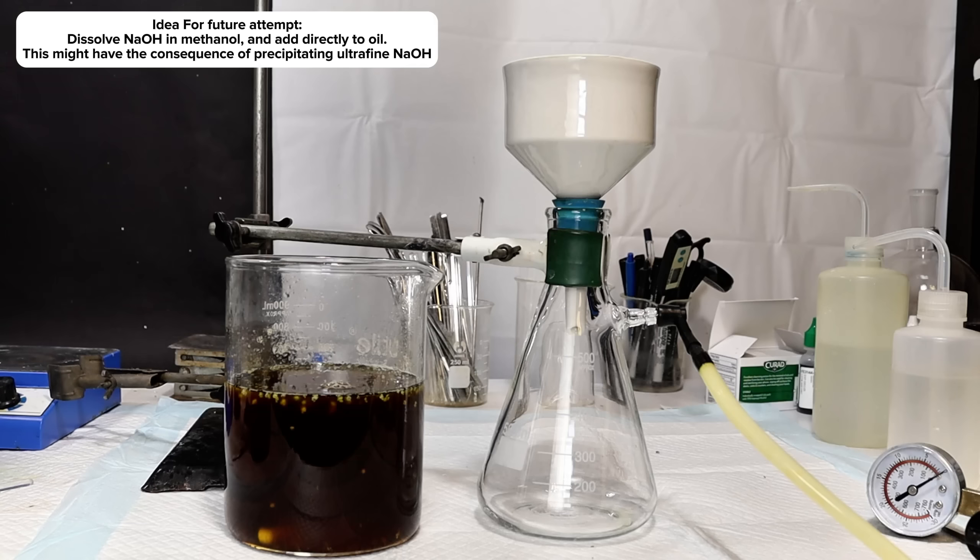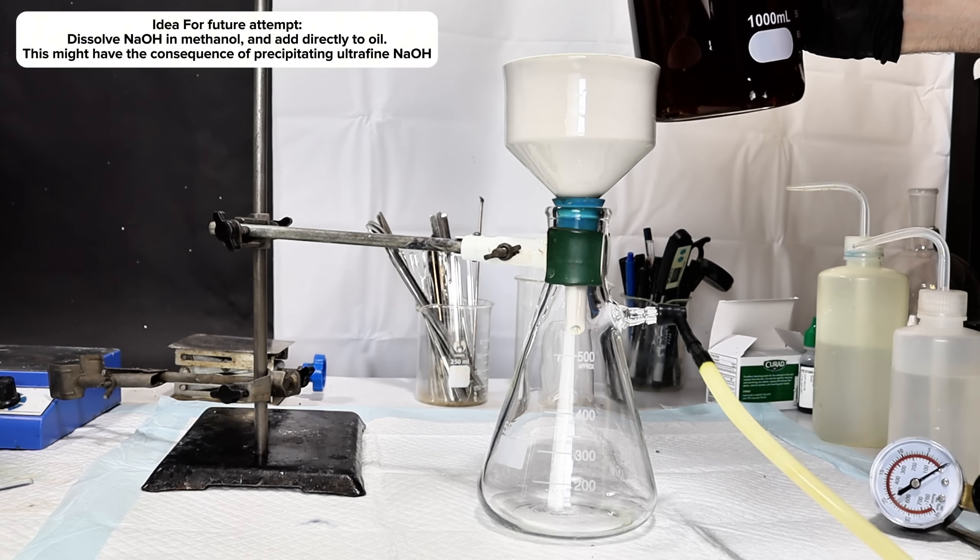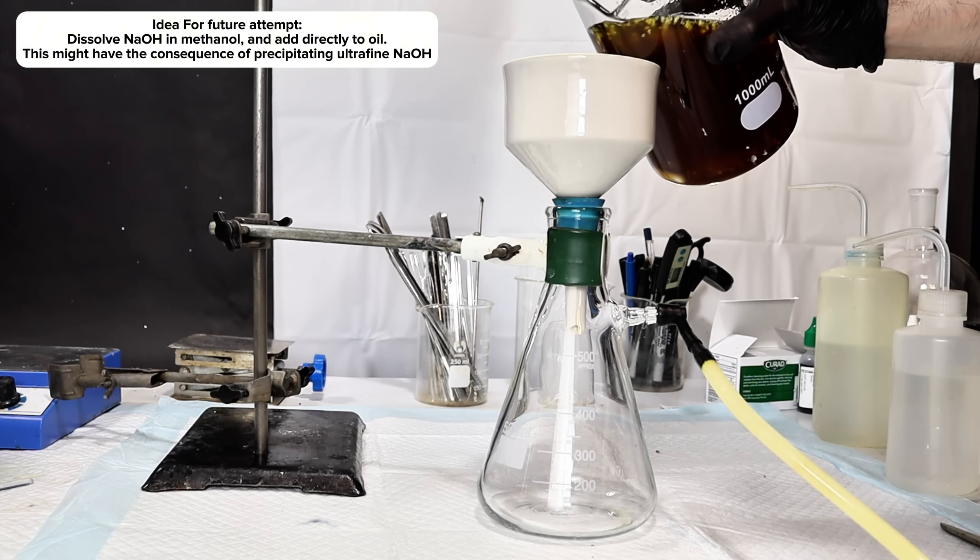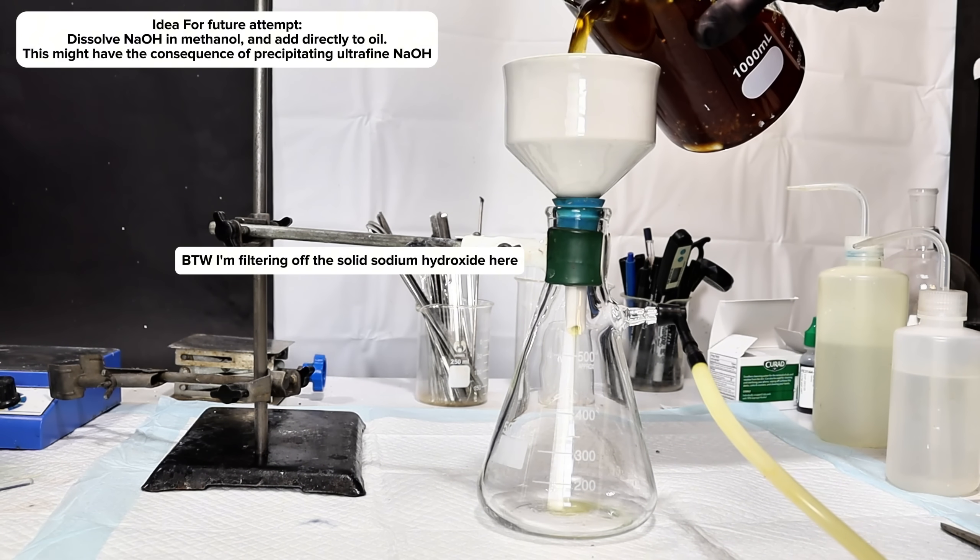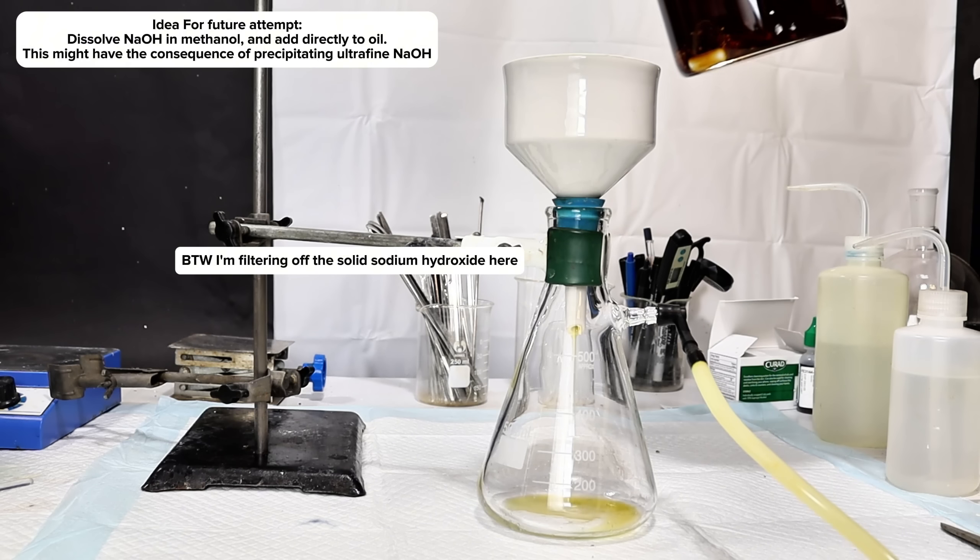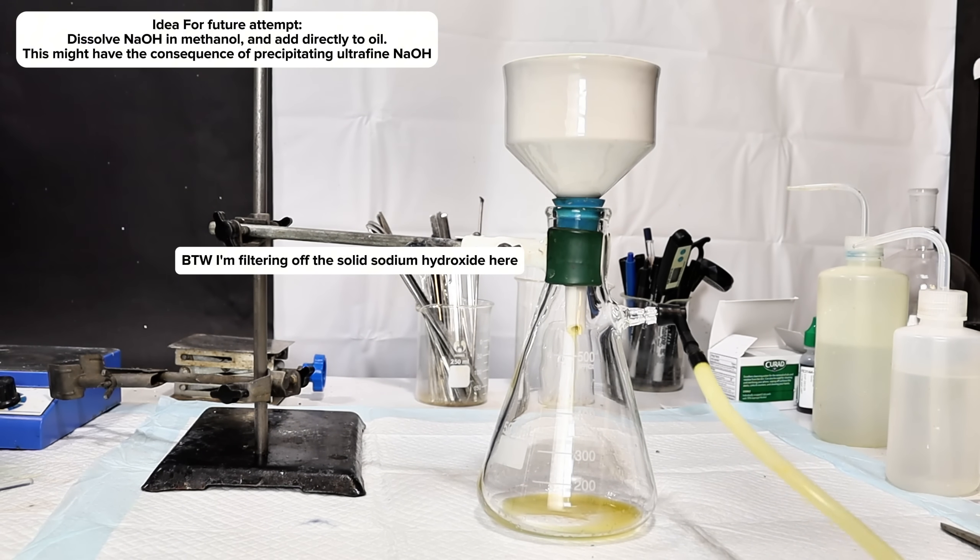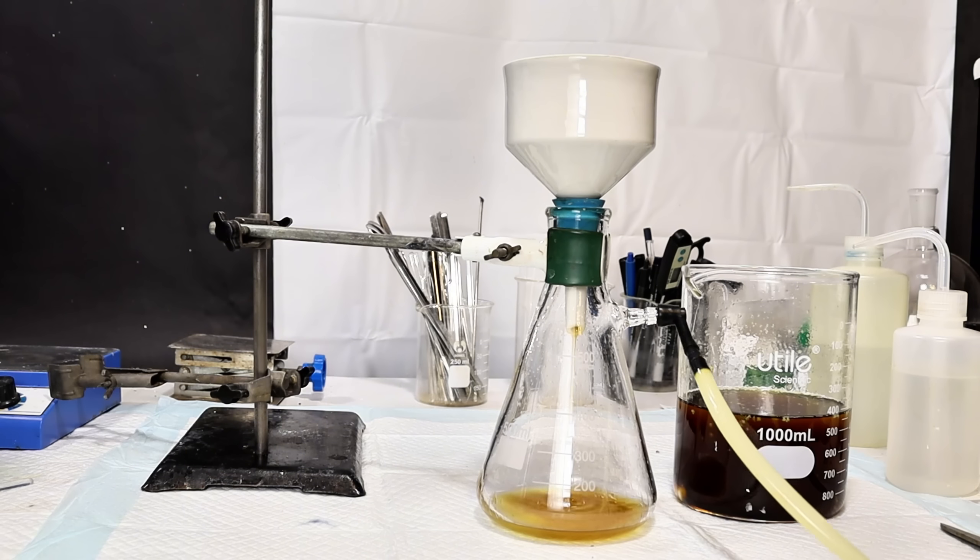That is, instead of directly adding granulated sodium hydroxide, I might try dissolving the sodium hydroxide in the methanol first using a bit of heat, and then add that to the oil. I feel like doing it this way would help the reaction go to completion a lot faster, but it might result in an ultrafine precipitate of sodium hydroxide, which could be more difficult to remove than the granules.